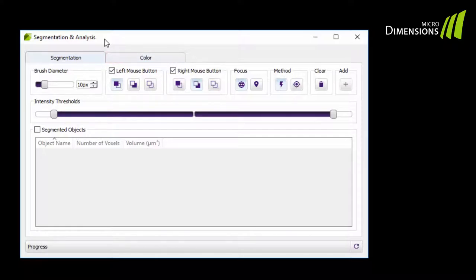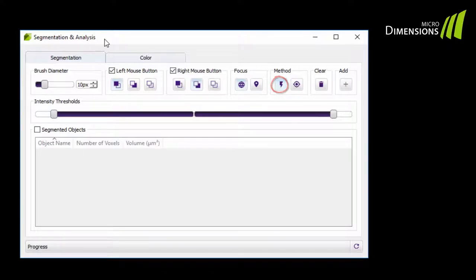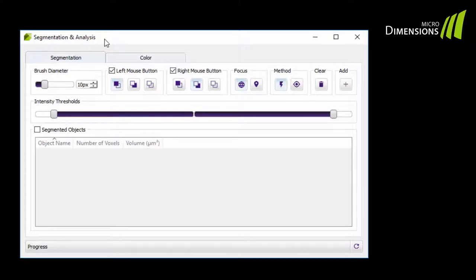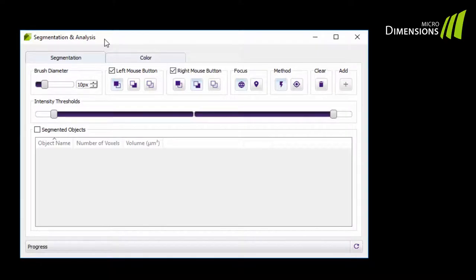Volume offers two different segmentation methods. You can choose between Fast and Accurate segmentation. The Fast segmentation will deliver good results in most cases. The Accurate segmentation is slower but will deliver more accurate results in difficult segmentations. I will show you an example of both methods now.